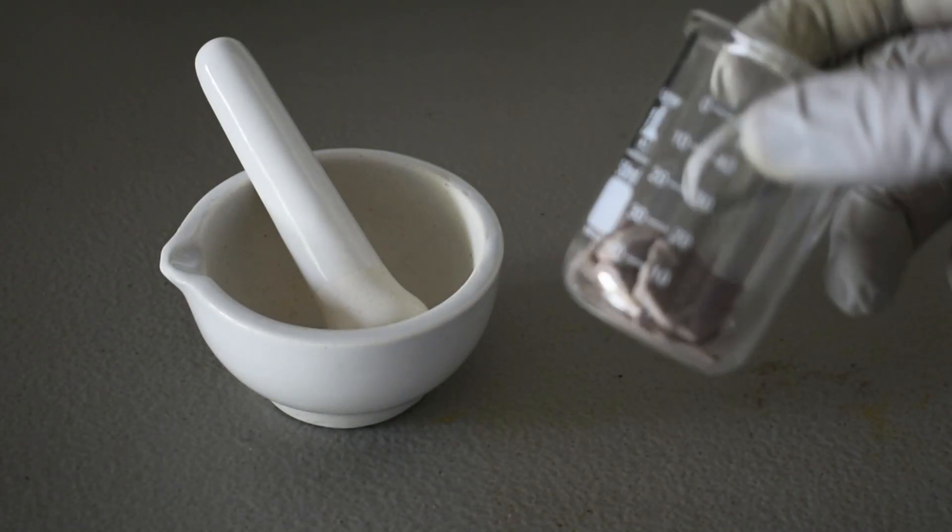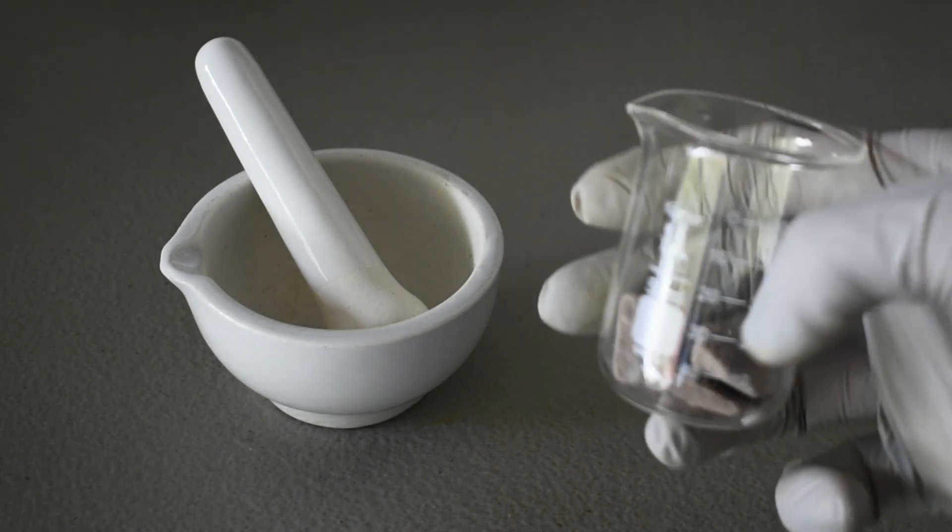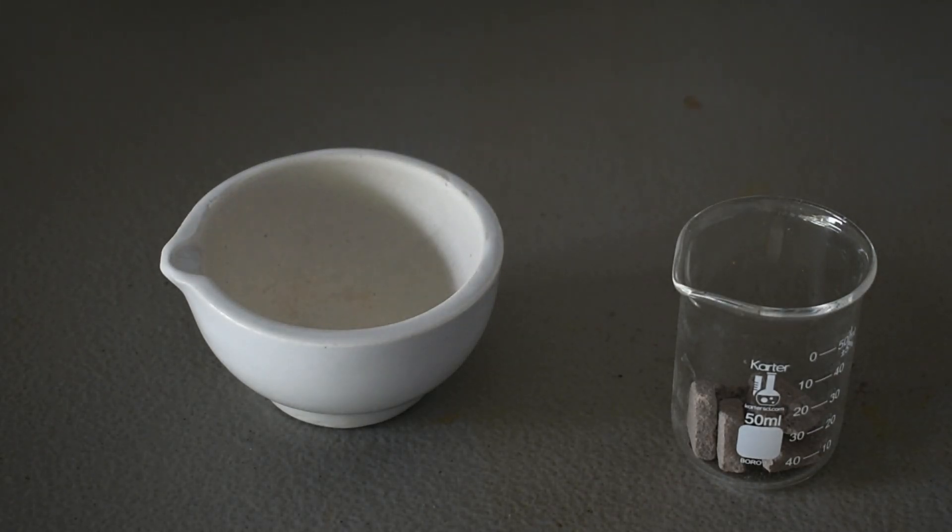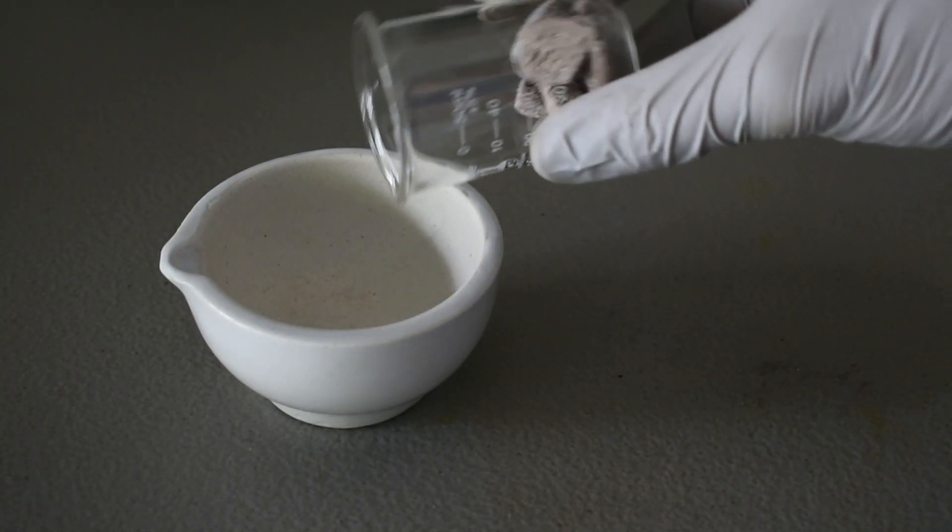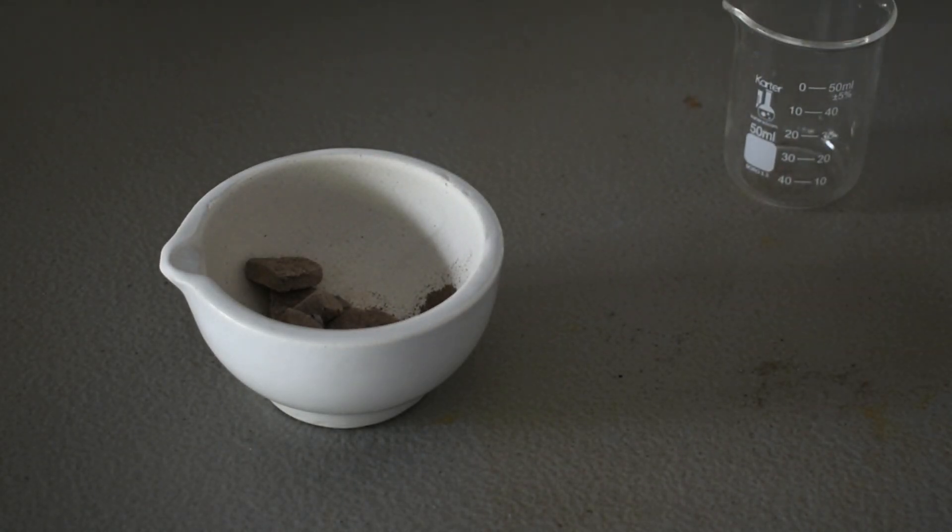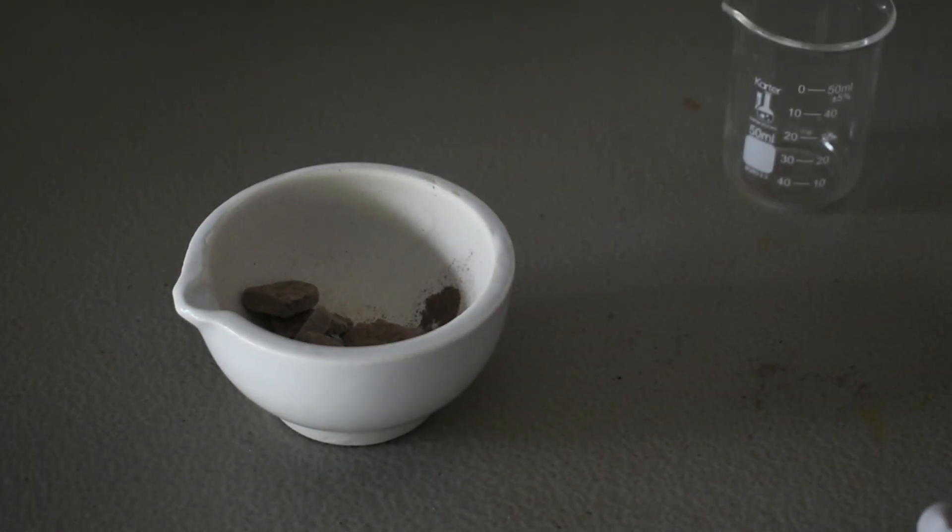Alright, I've weighed about 8.5 grams of iron 2 chloride, which hopefully hasn't oxidized too much. And I'm going to be grinding it in my mortar and pestle here. I prepared the iron 2 chloride via Nerd Rage's method where you take iron metal and you dissolve it in hydrochloric acid over a couple days.